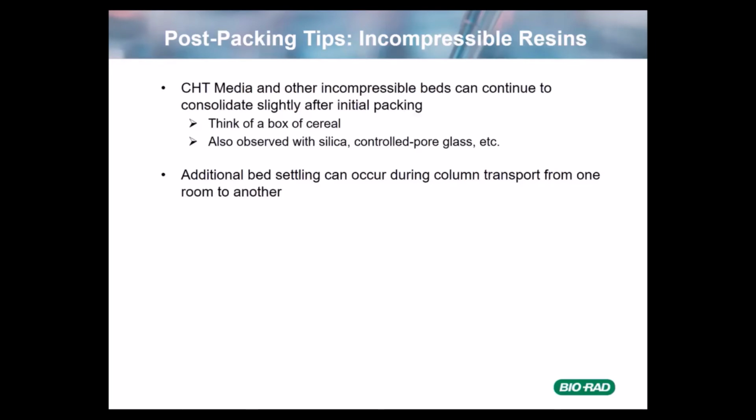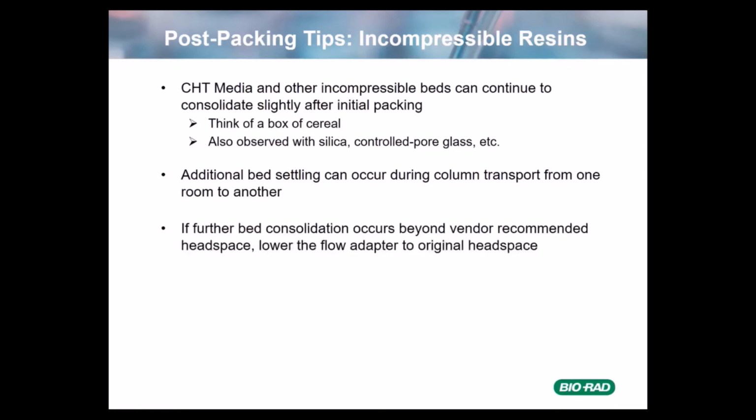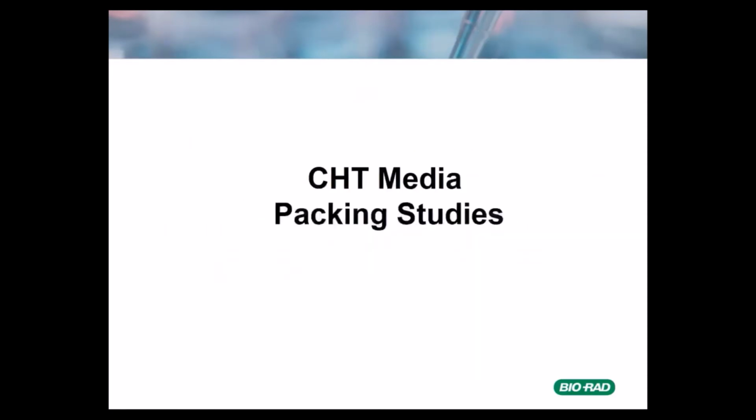You can also get continued settling over the first few cycles as the start and stop motion of the buffer or the solutions through the resin bed actually provide some additional vibration. If further bed consolidation occurs beyond the original recommended headspace, lower the flow adapter to the original headspace if you desire. But if you do this, I strongly suggest you incorporate these steps into a packing procedure to avoid discrepancies. That's going to make the people on the manufacturing floor as well as the people in QA much happier.